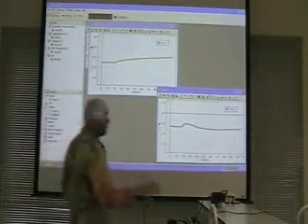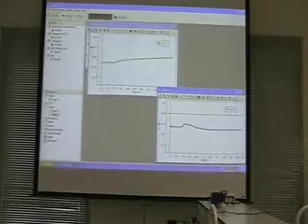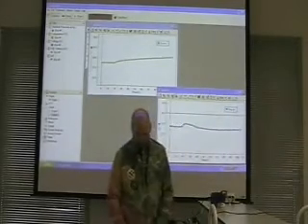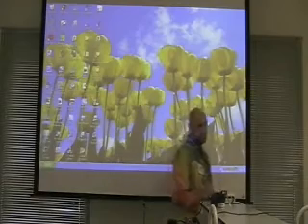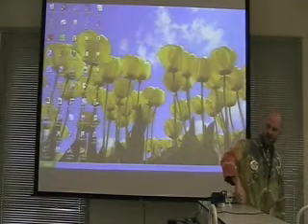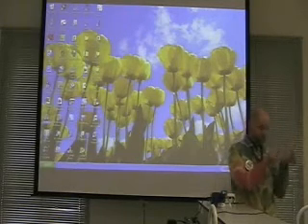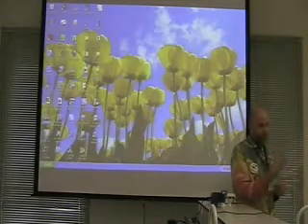Okay, this is a way to automate your readings on the GLS. Now, unfortunately, we don't have the software required to directly read off of the GLS. However, the GLS all it does is take light and turn it into voltage. So we can measure the voltage from the GLS, and it has a direct relation to the absorbance.